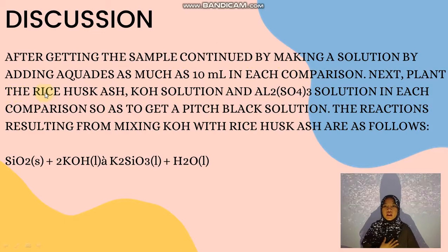Mix the rice husk ash, KOH solution and Al2(SO4)3 solution in each comparison so as to get a pitch black solution. The reaction resulting from mixing KOH with rice husk ash is as follows.